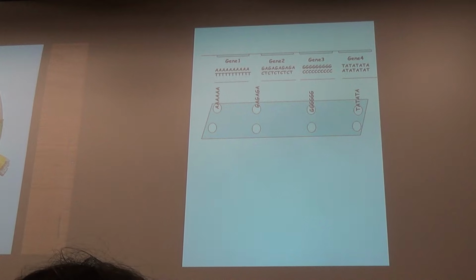And so in effect, on a single glass slide, you can put 30,000 pieces of DNA. Each one is specific for a specific gene, for example. So now, you have all 30,000 genes arrayed in little dots with the single-stranded DNA sitting out there, waiting for something to happen.